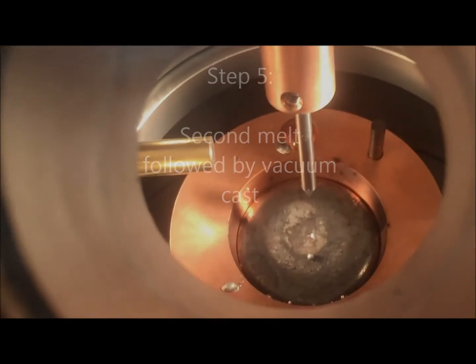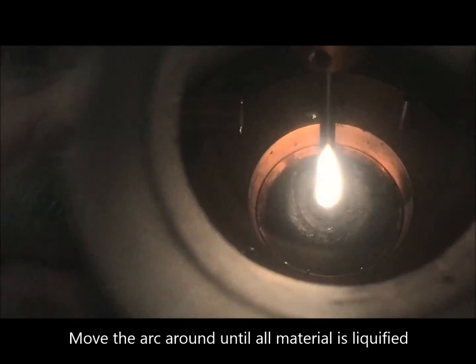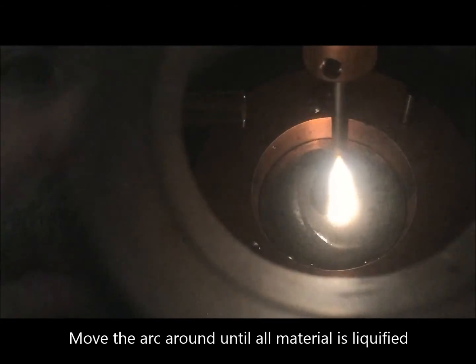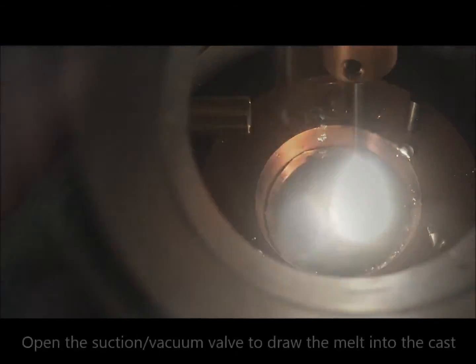Once you have achieved a homogeneous blend, simply open the suction casting valve and the molten materials draw into the mold cavity, resulting in a finished sample ready for testing.